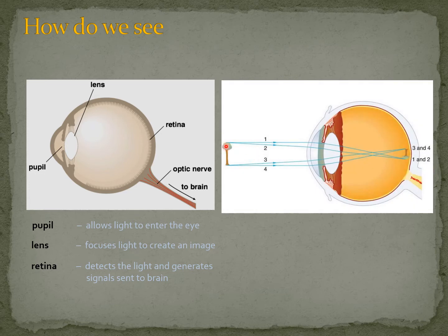When the light rays come from the object that we observe, the way the lens works, and we're not going into the details, they will focus on the retina, but the image will be seen upside down. For the purpose of this talk, this is not really important, but when building a microscope, and if we want to create an image that truly reflects the position of the object being seen, this can be one important detail.